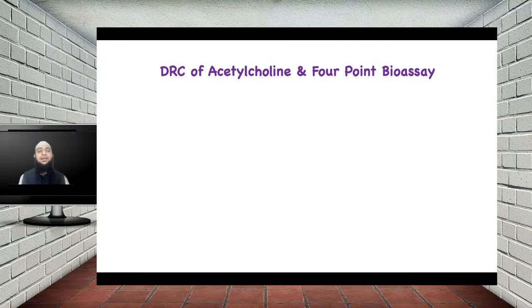Now let's see how to take the DRC of acetylcholine and how to perform the 4-point bioassay. As a regular procedure, first we take two responses of 0.1 ml and 0.1 ml of the standard, and once we ensure that these doses give the same response height at the same dose, it is called equipotency. Once you ensure equipotency, you can give the next higher dose, that is 0.2 ml. Then once 0.2 ml gives good gradation between 0.1 and 0.2, you can go ahead with the next dose, that is 0.4 ml, and then the next dose, that is 0.8 ml.